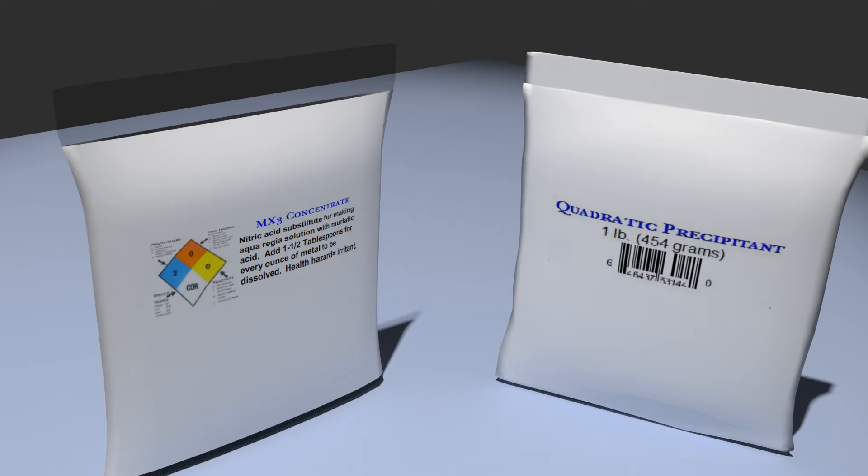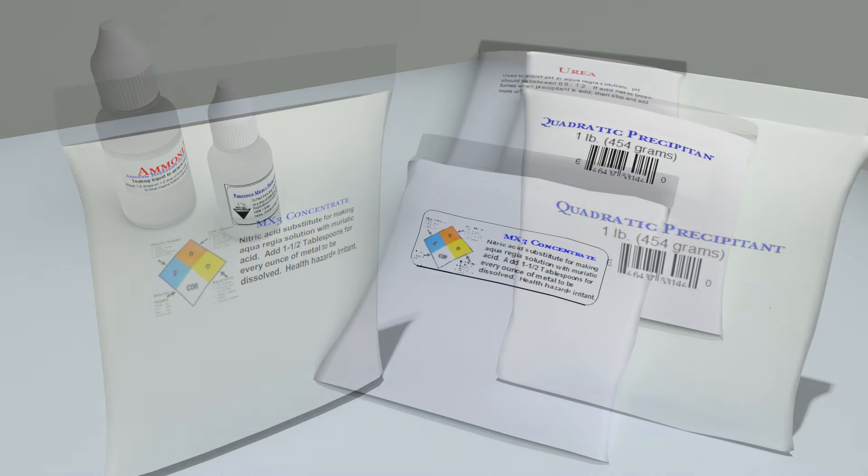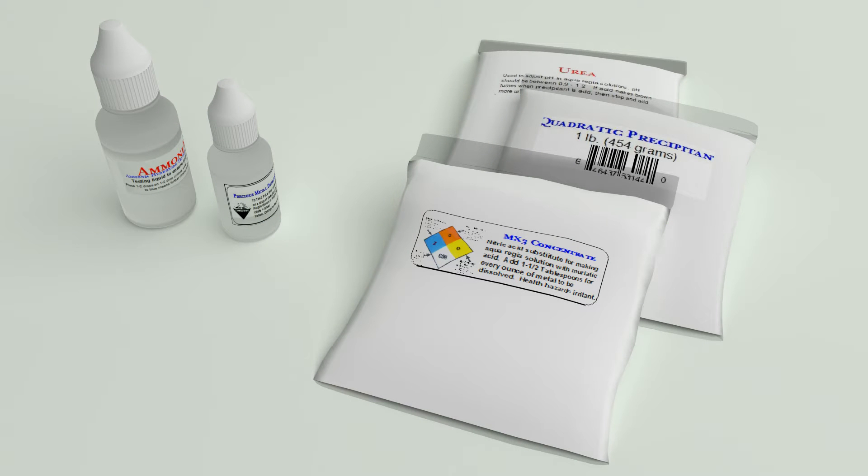These safe substitutes, MX3 and quadratic precipitant, are utilized in this kit. Just follow these simple video instructions and you will refine your gold to 99.95% with no losses, even the first time you use this process.